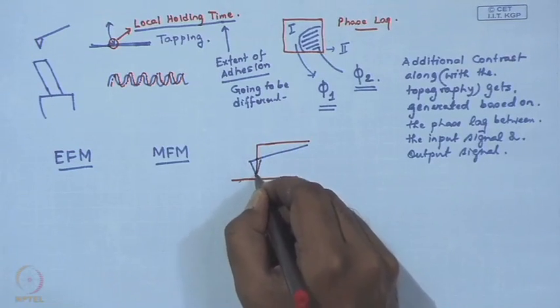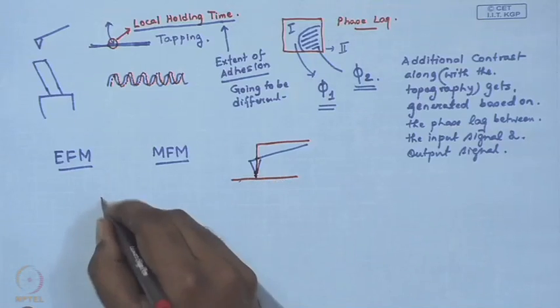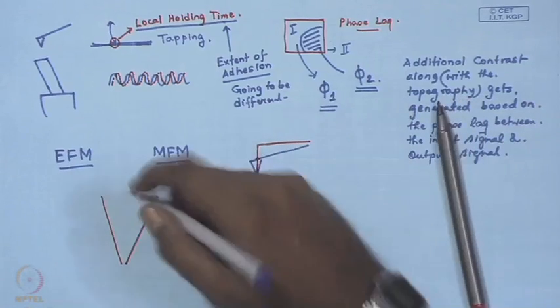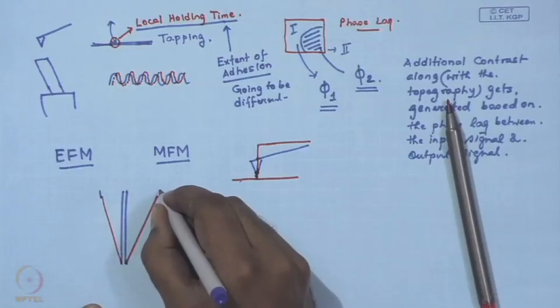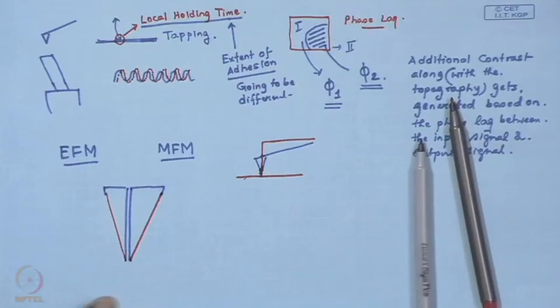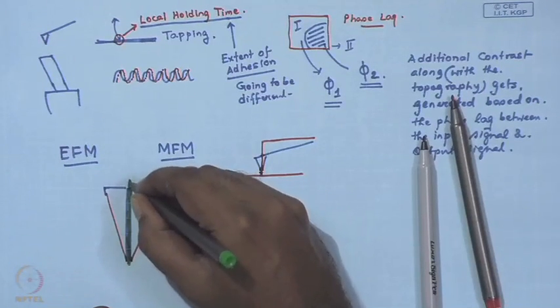So, typically a platinum wire is drilled through a glass probe like this with an annular opening, through which the platinum wire is sent. I will draw it in greater detail. So, this is the probe now. It is a little bigger than a standard silicon probe, which results in a little bit of loss of lateral resolution. This is how the probe looks now. You typically insert a platinum wire or any conducting wire through this.